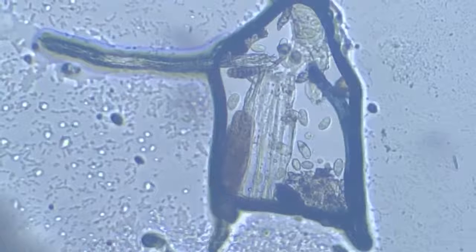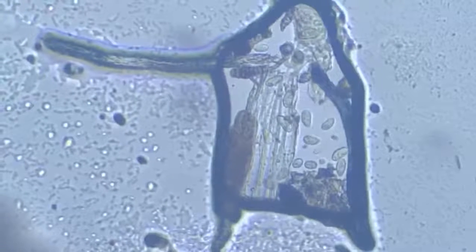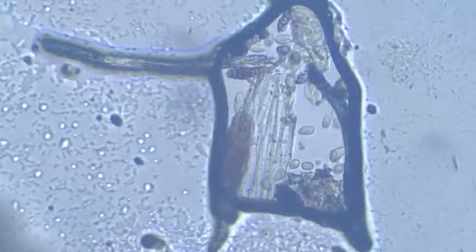These little euglenids are under extreme stress. We'll zoom in to a higher magnification here and focus. These are bacteria that we see.